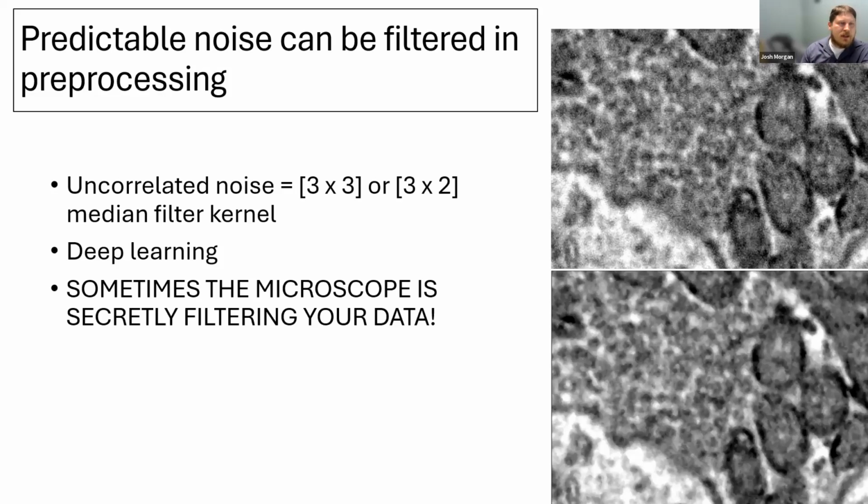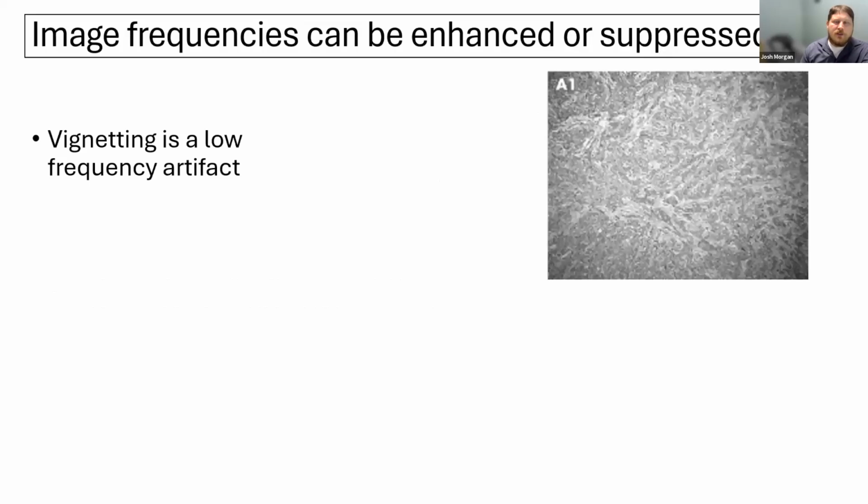Now, just generally, filtering with image frequencies can be useful. This is a pretty common thing that you see when you're doing EM imaging, that you have vignetting, the corners are dark. If you're zoomed in, that's not such a big deal. When you're trying to acquire large fields of view, you start to see detector effects and beam geometry effects. And if you try to make montages of these, one, the montages look weird because you have these weird dark corners everywhere. But you're also creating artificial edges all over the place, which can really cause a lot of problems.